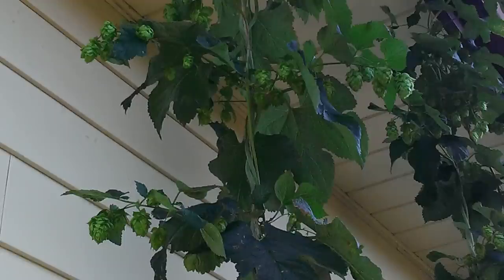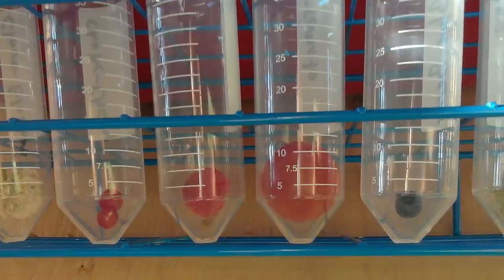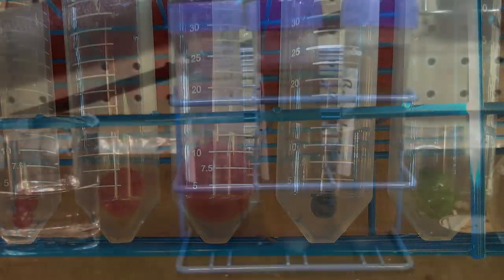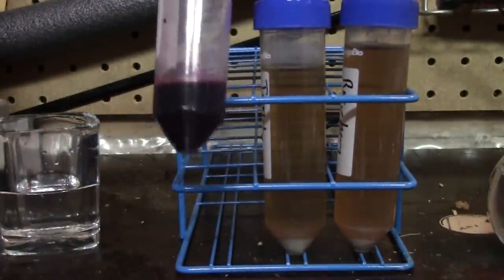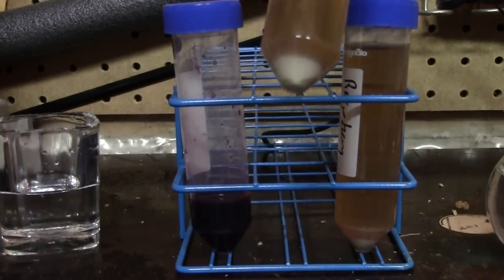You then collect them into some sort of a clean container. In my case I use centrifuge tubes, but you could just as easily use a small jar like a baby food container that you've cleaned quite well. Then you want to put clean, fresh wort into that tube and let it sit and begin to ferment.